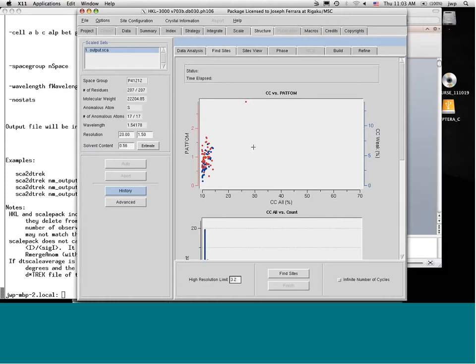You can let this run a lot longer. I know in the CCP4 interface, I think it's 200 tries or 300 tries, and so on. But you have to have reasonably good data to do sulfur SAD. If you have 2.8, it might be tougher. Although yeah, I'll stop there.